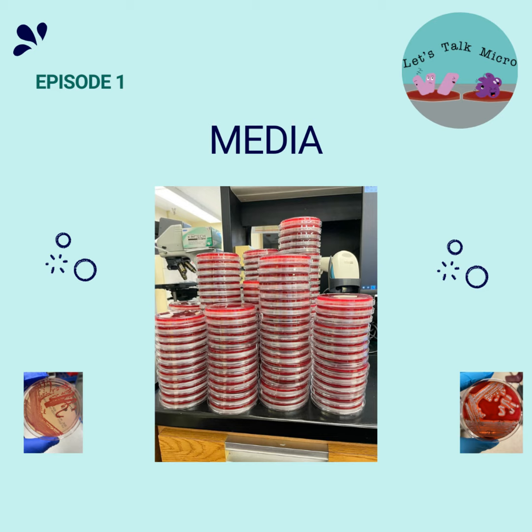And that brings us to quiz time. So let's start with blood agar. What kind of media is blood agar? It is nutritive and it is differential for hemolysis. It is not selective. Gram-positive cocci, gram-positive rods, gram-negative rods, gram-negative coccobacilli, yeast, they will grow on this agar.